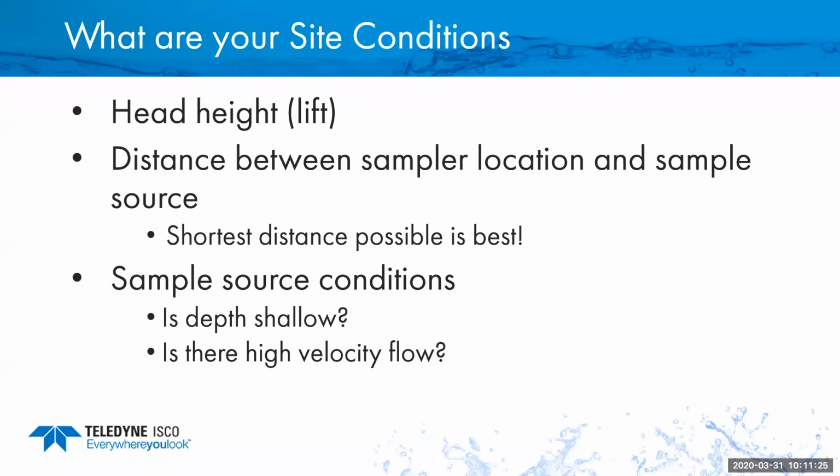Another thing you want to consider is the distance between the sampler and its source. This determines the length of suction line you need. Most peristaltic pumps, the pumps with the spinning paddle and the soft medical-grade silicone tubing inside, are limited to about 99 feet. They can go that long, but I wouldn't recommend it on a peristaltic.